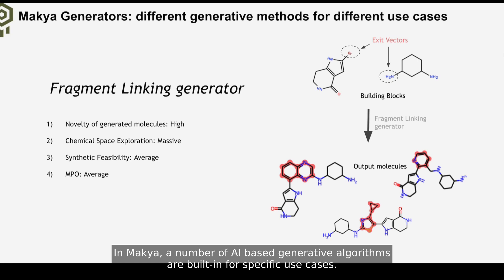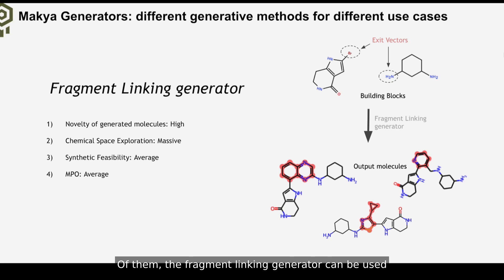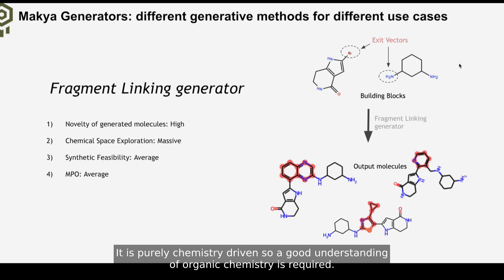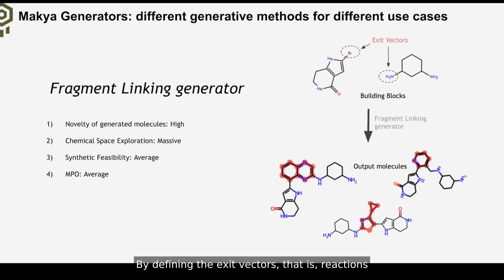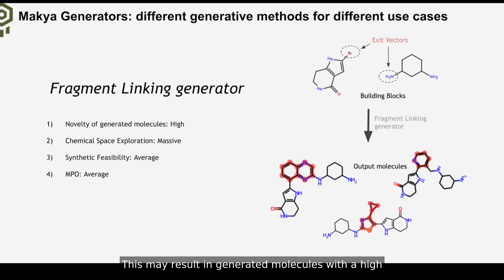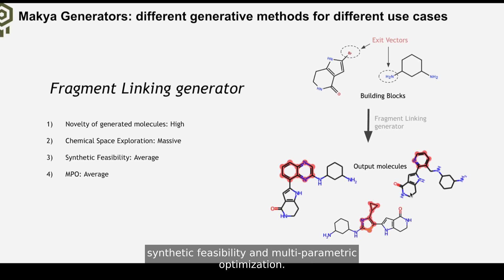In Makya, a number of AI-based generative algorithms are built in for specific use cases. The Fragment Linking Generator can be used for generating compounds by proposing new linkers or scaffolds between two building blocks. It is purely chemistry-driven, so a good understanding of organic chemistry is required. By defining the exit vectors — that is, reaction centers where the chemistry will take place — the generator will search for commercial building blocks which can react in such positions. This may result in generated molecules with high chemical diversity, albeit an average potential for synthetic feasibility and multi-parametric optimization.